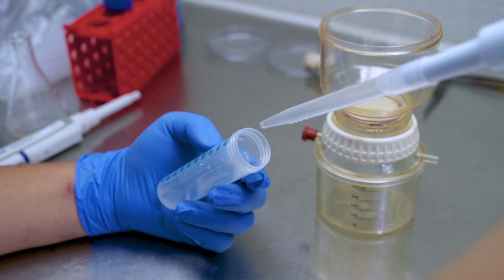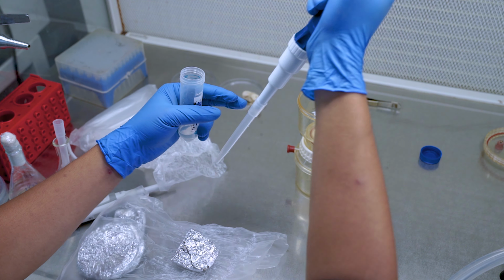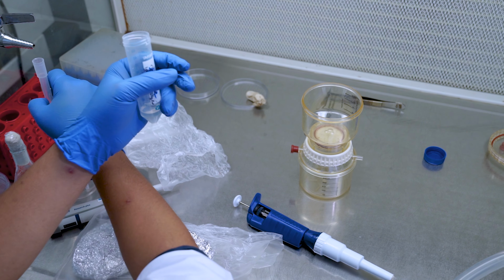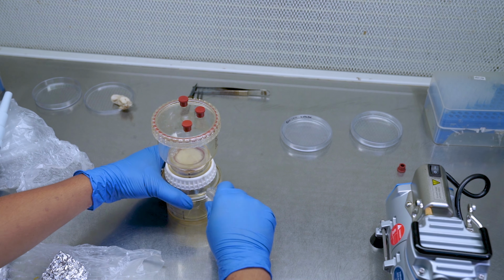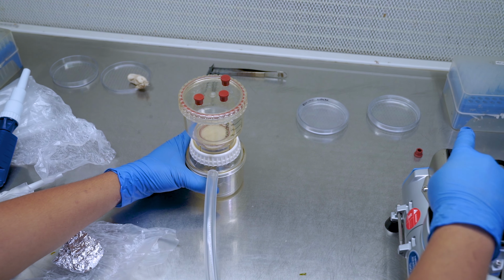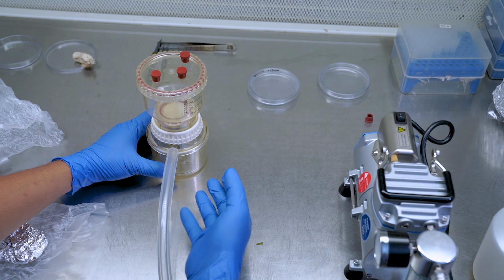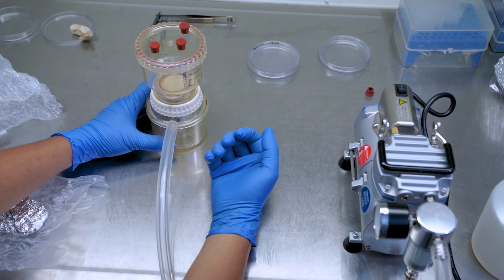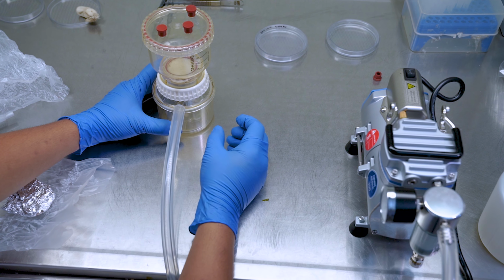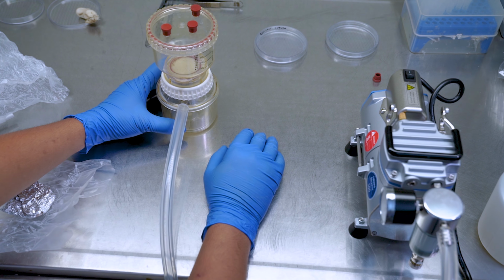Around 5 to 7 ml of my Agrobacterium, and I will let it infect for around 45 seconds. After 45 seconds, I will switch on the vacuum pump, which will create a pressure deficit where the media will fall to the bottom and only the cells will remain on top of the filter paper.